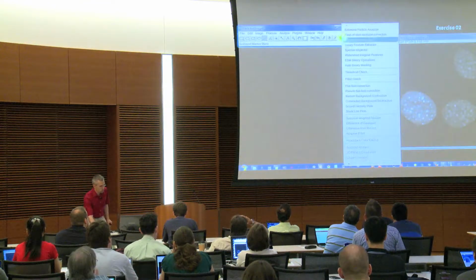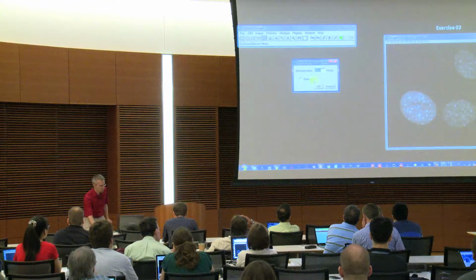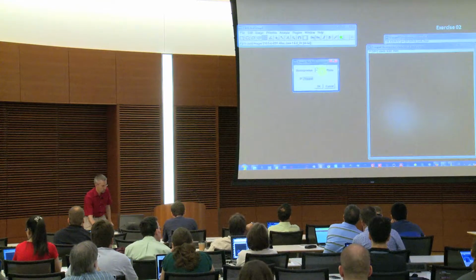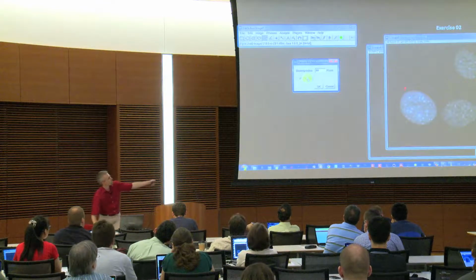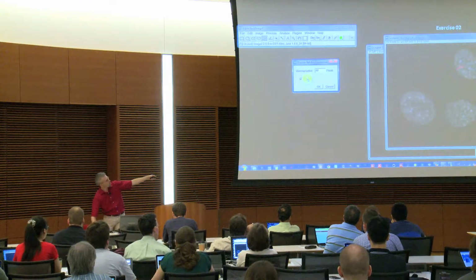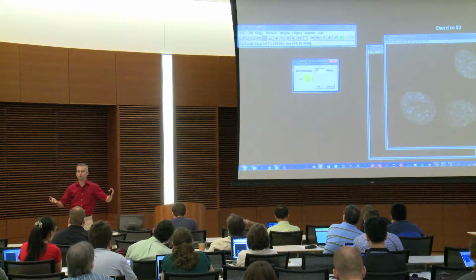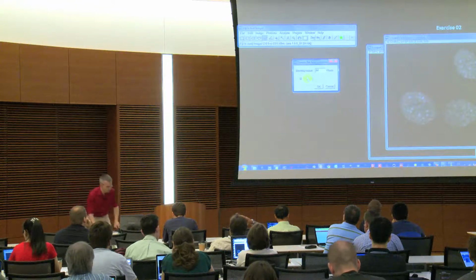So when you go to the green cube and use again the pseudo flat field correction here, in this case 50 is a little bit too low, the radius, but we can test it. So I mean, see here, if we go to 80, then it blurs that a little bit stronger. And then you see actually beforehand they were different, and if I activate the preview, then you see they are very similar. So now you can't use those images obviously anymore for any kind of measurements, that's clear, but it should help to push that into the same intensity.